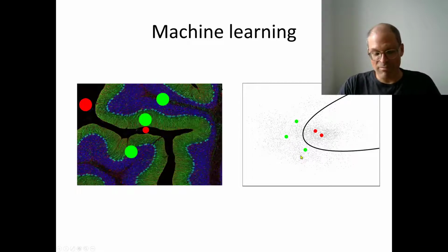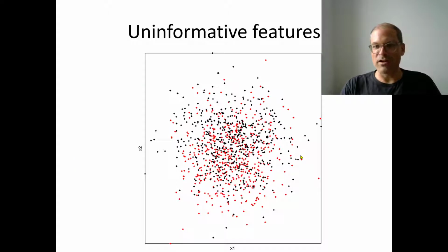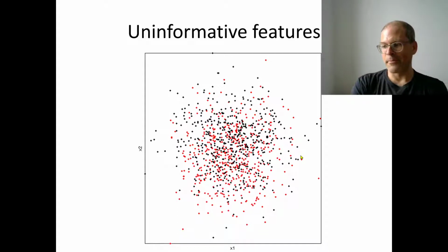And then my classifier will just overfit, or it will give bad predictions. And if the features are inadequate, the only thing I can do is add more, hopefully more informative features. I've given you another example here.